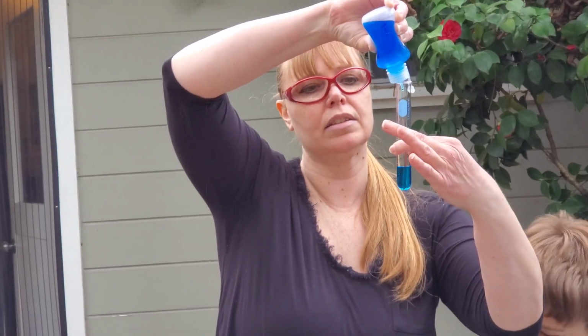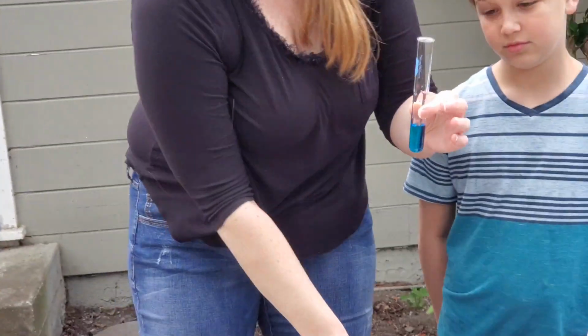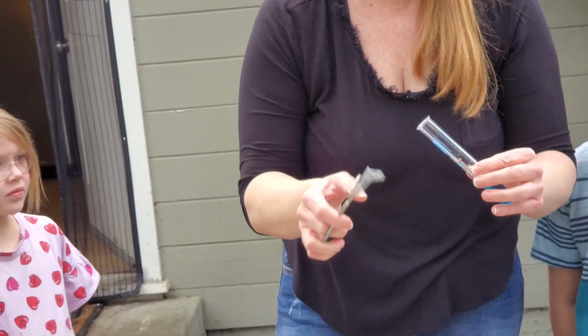We're gonna pause and I'm gonna come back. I'm gonna let this sit. Oh wait, actually we don't have to. It's happening right now. Okay, super cool guys. That iron nail, this is not magic, but it sort of looks like magic.